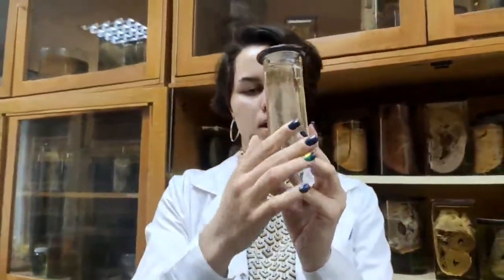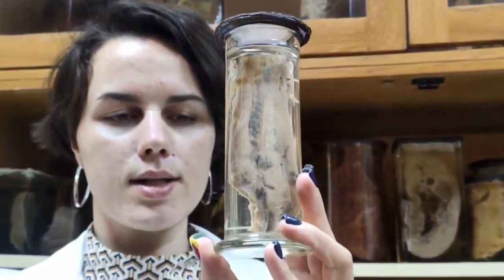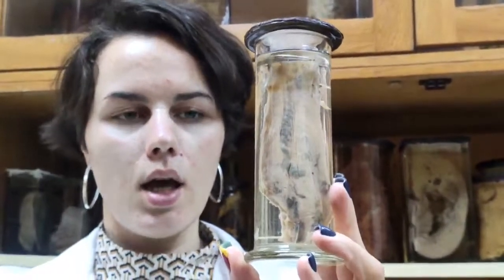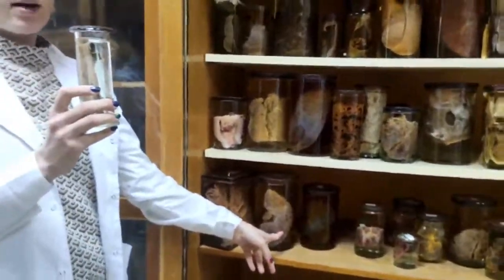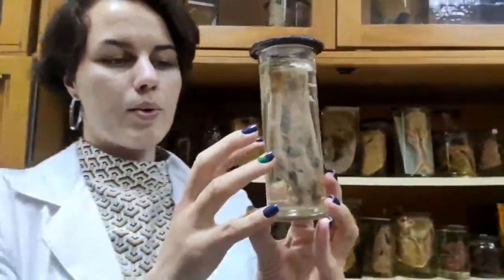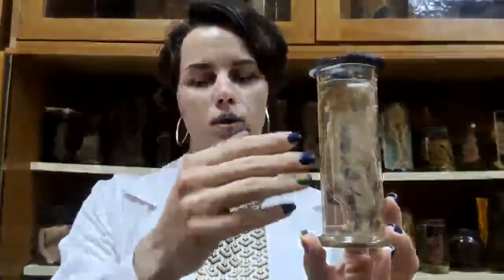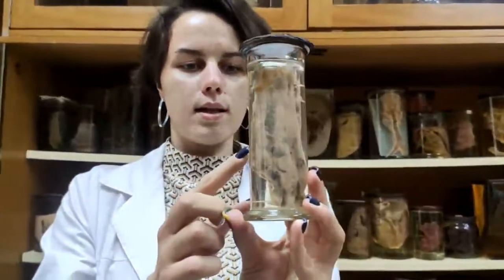The next specimen is the esophagus, and you can see varices in the esophagus. What are varices? Varices are dilated veins because, as I told you, in patients with, for example, cirrhosis, portocaval and cava-caval anastomoses are opened. In normal people we can't see any veins on the mucosa of the esophagus, but in patients with chronic alcoholism and cirrhosis, for example, we can see these dilated veins.